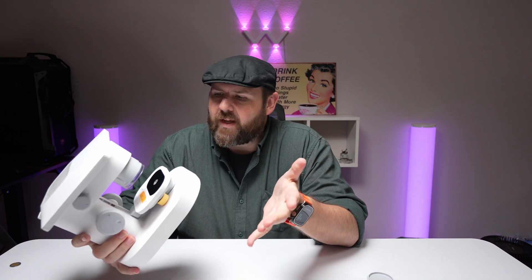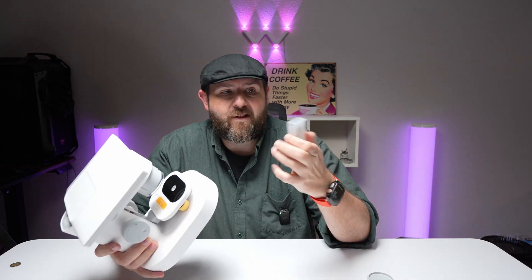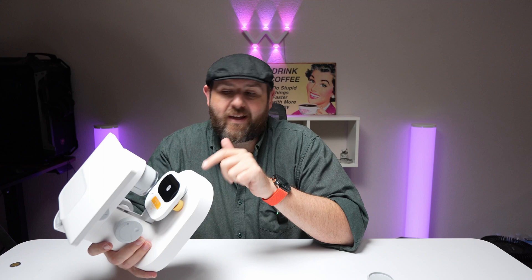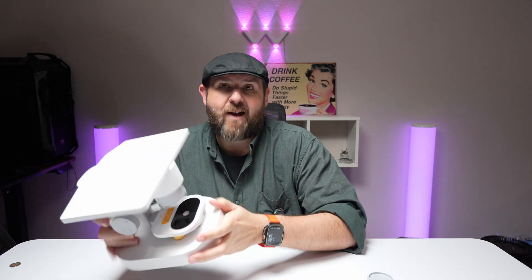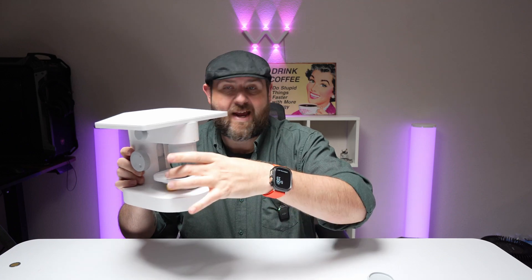Hey everybody, so I got a new microscope to show you today. I've had this one for a couple months, I just haven't gotten around to actually using it and getting a good feel for it. I actually lost a couple pieces to it, so you do get more slides — this one's from a different microscope I have. Apparently I can't find the slides that came with this one, and it has little clips that clip the slides down and it's magnetic, and apparently I lost that as well. But let's go ahead and just show you the microscope.